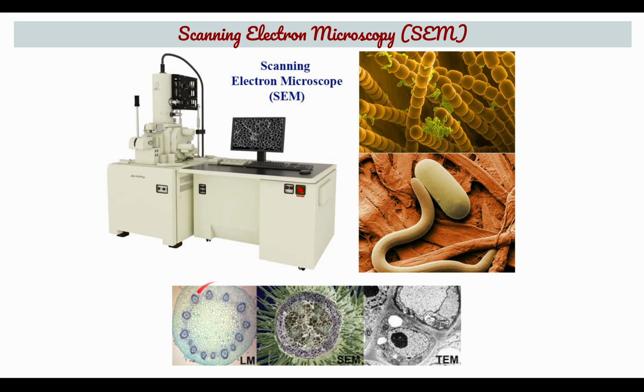And this is how you can see from the light microscope. This is also one of the images, where if you focus, you can distinguish the internal compartments present inside the specimen or the cell. This is from the scanning electron microscope. In this case also you can scan the top surface of the cell without looking into the inner details of a particular cell or specimen. Whereas this is collected from the TEM, the transmission electron microscope, where you can focus on the inner compartments of an object, because electrons are transmitted through the object. So this is how different images appear from different types of microscopes.